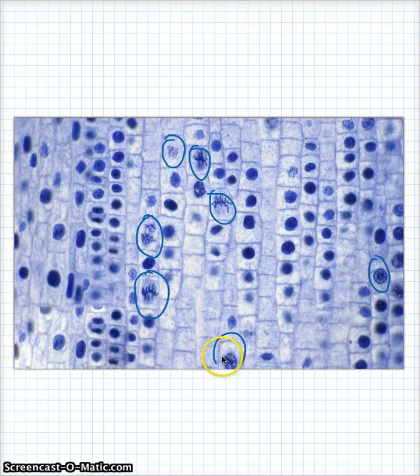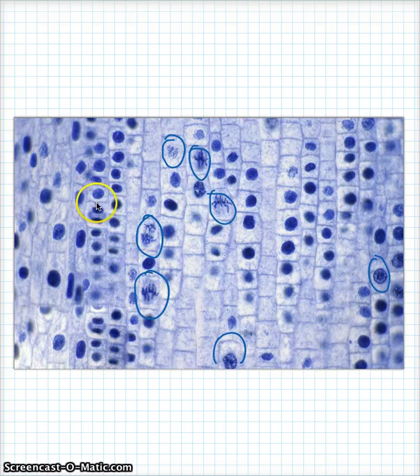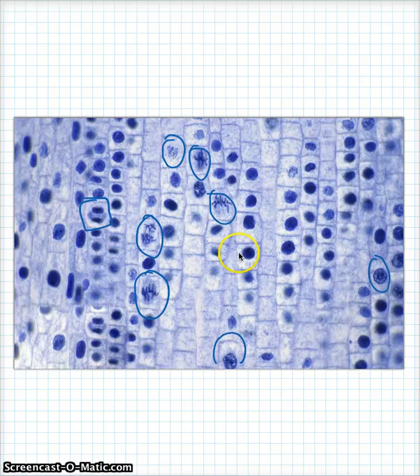Telophase. Find one in telophase. There's a couple of good ones. Here's a great one. Look at this. See the little cell plate starting to form? See the spindle? The two really solid nuclei starting to form. The chromosomes are still there. You can still see them.